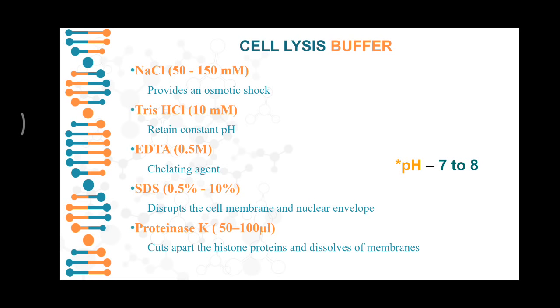Proteinase K. It specifically cuts apart the histone proteins and subsequently dissolves the membranes. Proteinase K is an enzyme which specifically targets histone proteins.